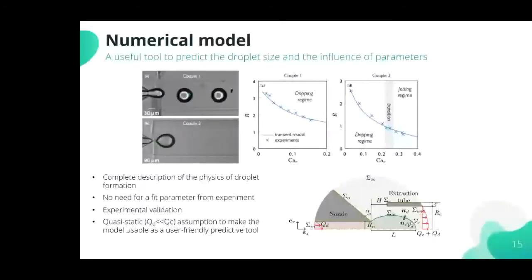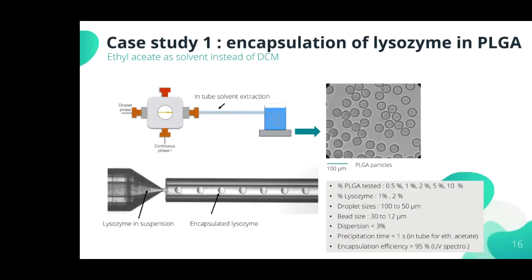Okay, thank you, Benoit. Now let me show you two case studies with our device. The first one is the encapsulation of protein in PLGA beads. We're not going into detail because it was the subject of a previous webinar from Fluigent. If you're interested in this application, you can find more information on their website.